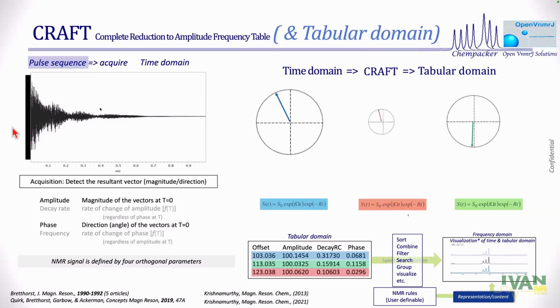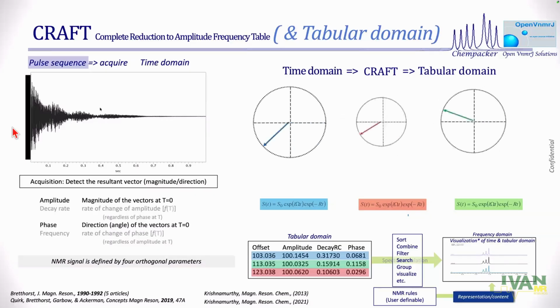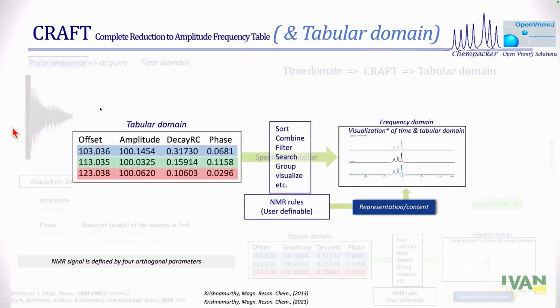So now it gives us two tools or two potential places where we can visualize the data in a different way. So most of my work today, most of my talk today, our workshop, is going to be focused on that.